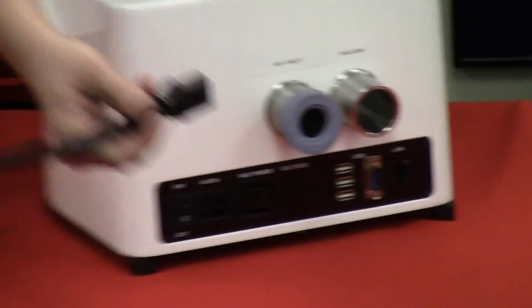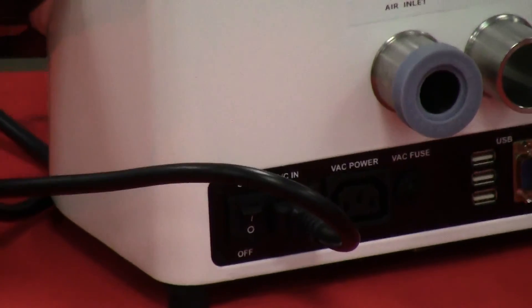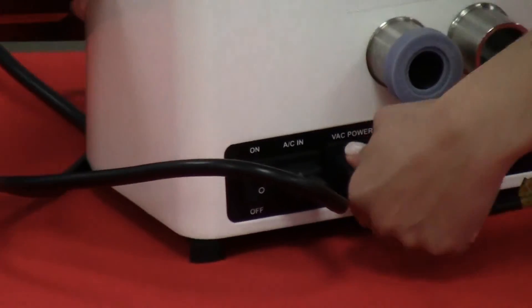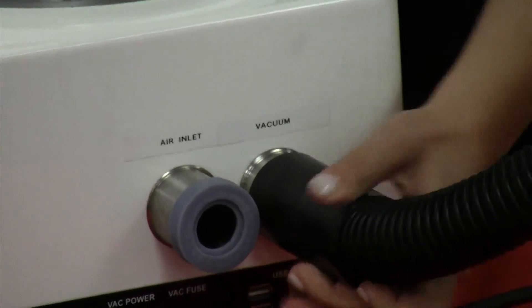I'm going to be taking the AC power cord and plugging it into the AC power outlet. The vacuum cord is plugging into the vacuum power outlet. And then the vacuum hose itself is going to be attached to the nozzle on the back of the unit labeled vacuum.